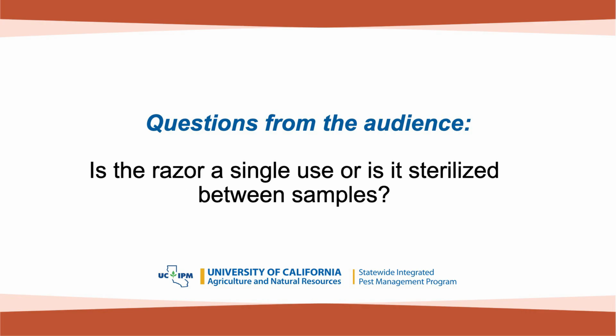Is the razor that you used, is it a single use or is it sterilized between samples? Oh, so it's single use, but we reuse them. So we single use them and then we come back and we sterilize them. So we wash them and then we don't have an autoclave, so we bake them. But some people put them in like a crock pot or a toaster oven or some other way in order to sterilize them. But yeah, they are single use, but then we reuse them.